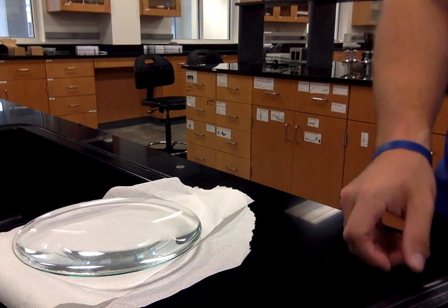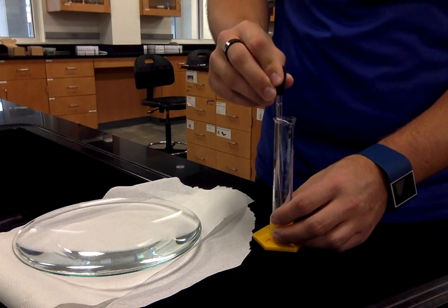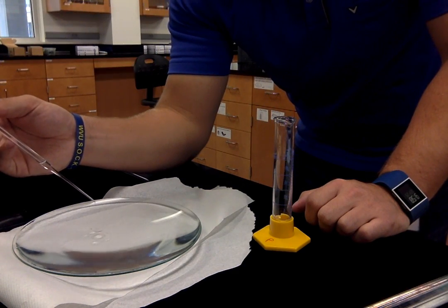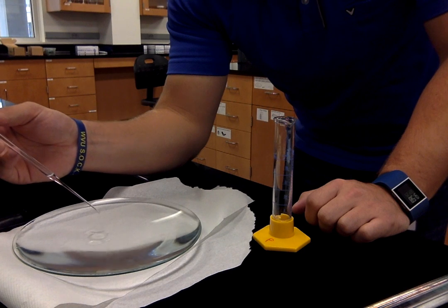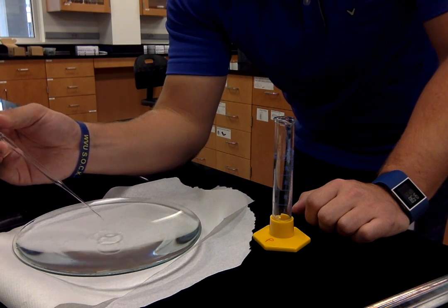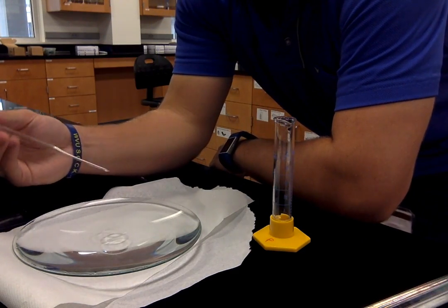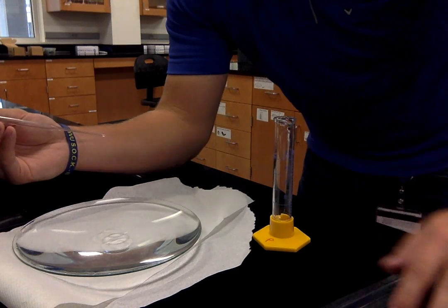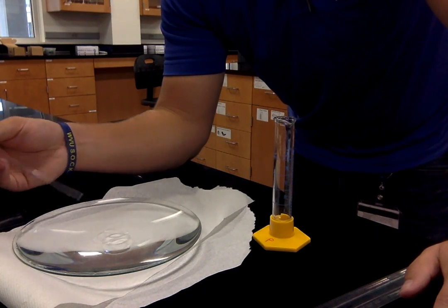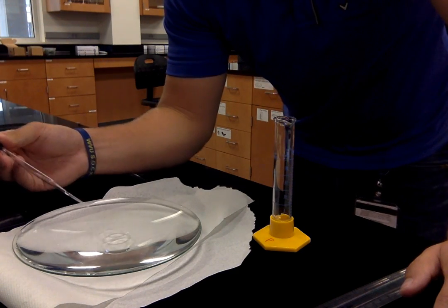Then what you're going to do is take your stearic acid solution and add it dropwise to your watch glass, and as you can kind of see, it's forming a little monolayer. Okay, well, I'm doing this pretty quickly. You're going to do it dropwise, and you're going to count each drop. And since you know how much volume is in each drop, you're going to be able to calculate exactly how much stearic acid you're putting into your solution.